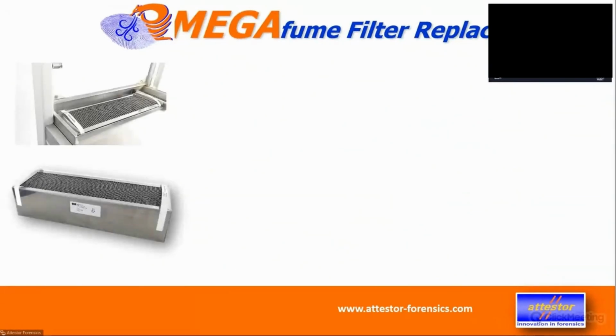Now, talking about the filter replacement, as I said, this is the standard filter which we developed and which we have been distributing and supplying for quite some time. We had a lot of customers that loved it because they said, we don't want to have something to refill and the dusty work and whatever. We want a fully encapsulated system, so a cassette that we can just lift out and place in. There is no mistakes to be made, just very easy to handle.